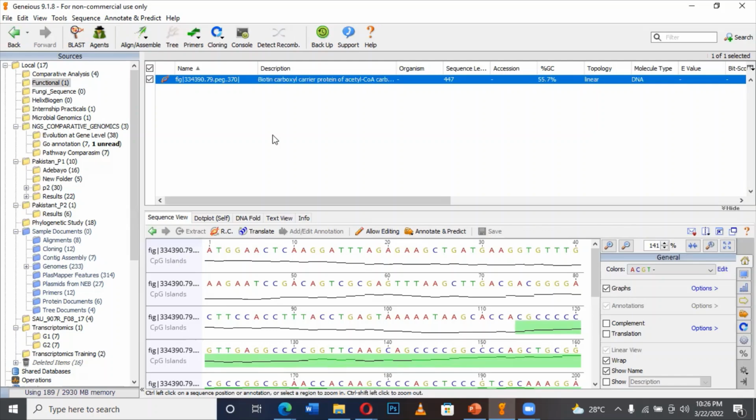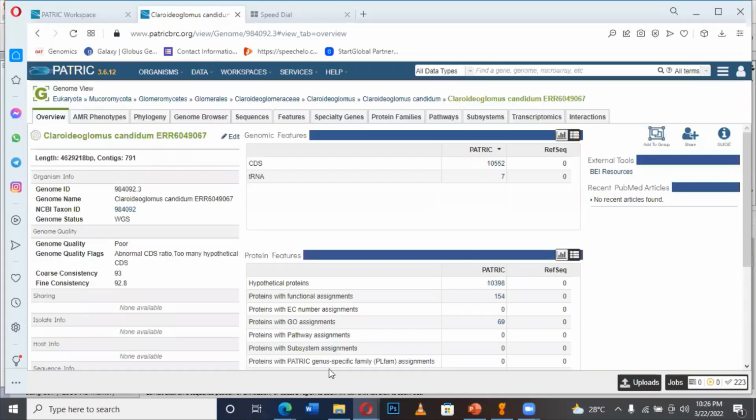So you can do that kind of analysis, and then once you understand the variant, you can understand effect prediction on protein, all right, on the protein function. Okay, what protein is affected and what are the possible effects that it can render on that particular organism. So that's just the aspect of variant sequence analysis or mutagenesis study. All right, so let's go.